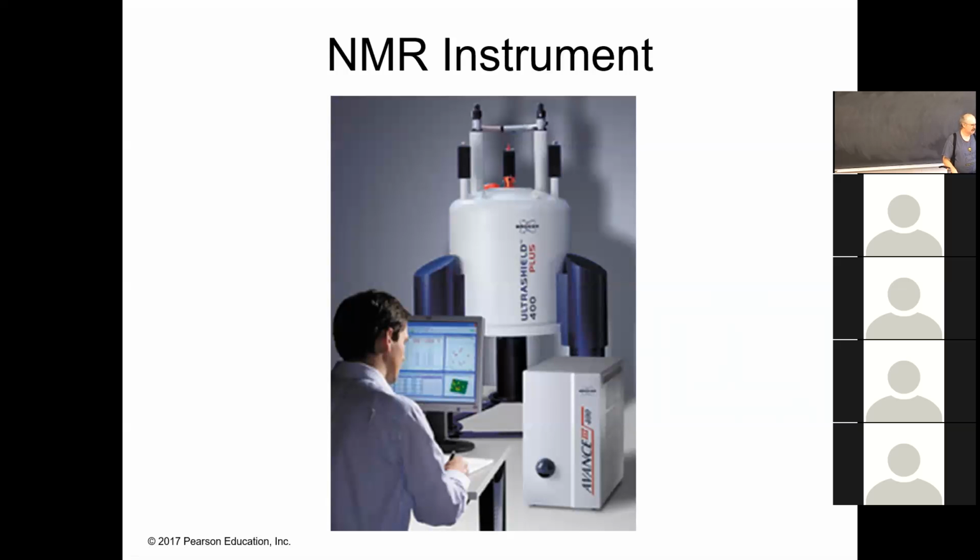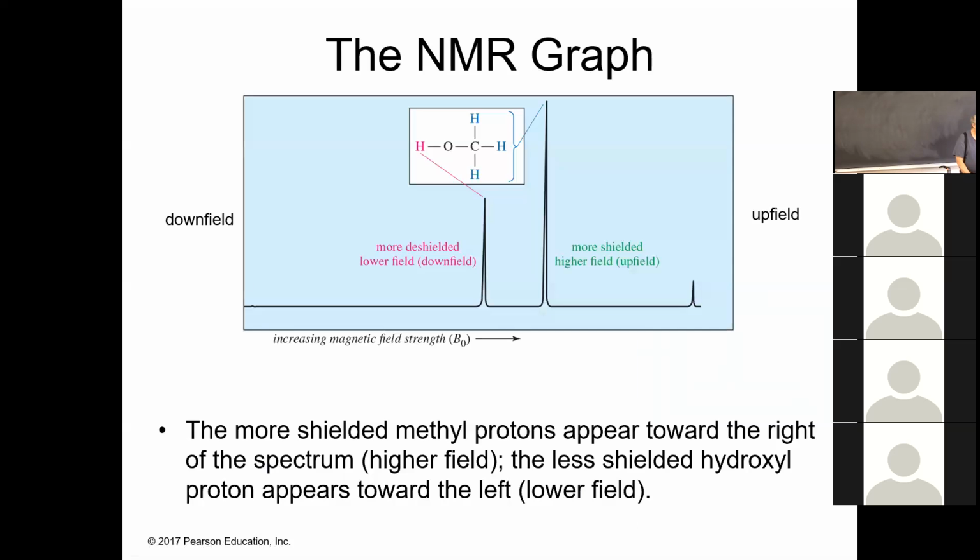He was curious as to what this was. And the magnet was so strong that they found him the next morning. He was stuck to the magnet. He couldn't get his tool belt undone. How'd they get him off? They actually had to shut down the magnet. They had to shut down the instrument. That's crazy. He was embarrassed, but otherwise all right.